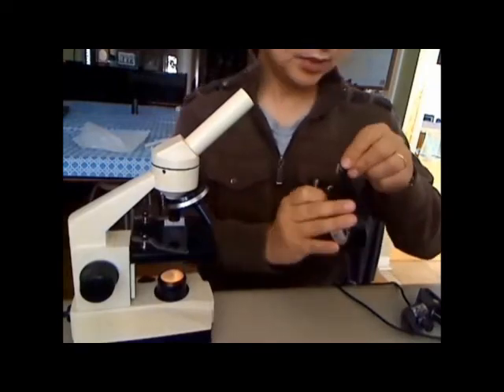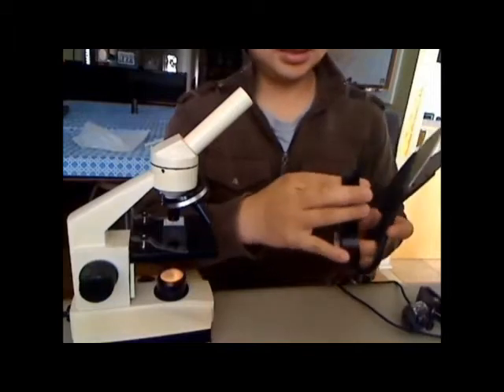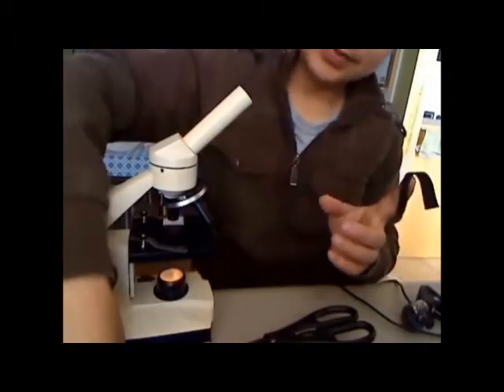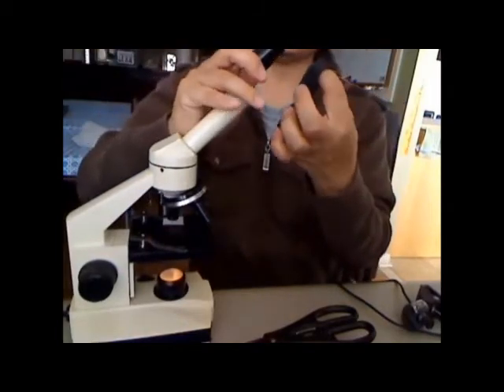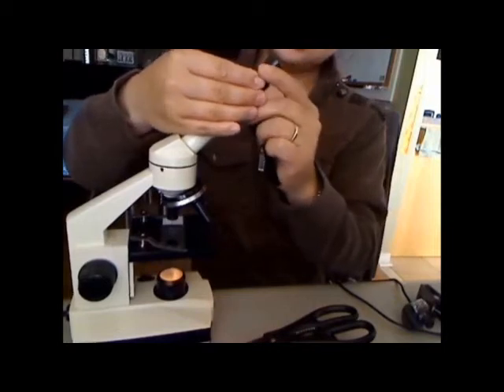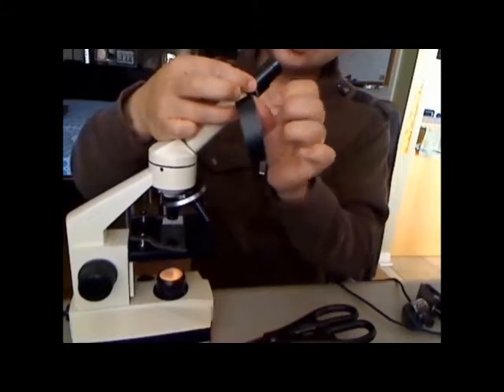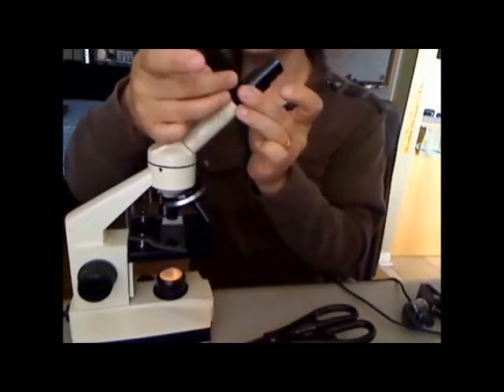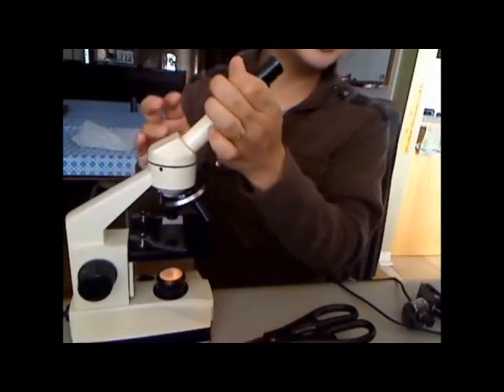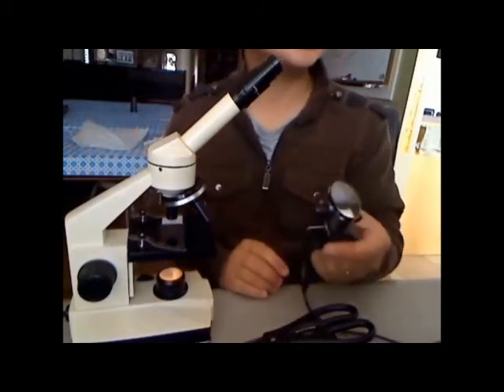You'll need scissors. Cut around this much tape, put the ocular lens in — try your best to fit it — and tape it around. Make sure it's secure, and voila — that's pretty good.